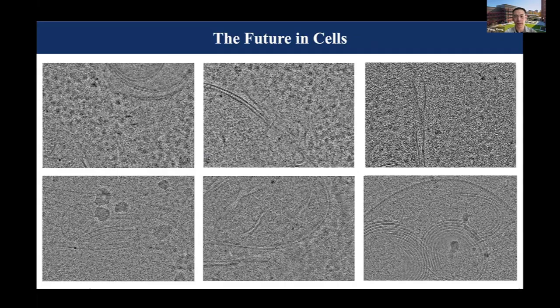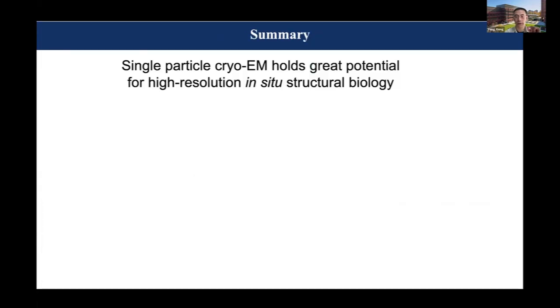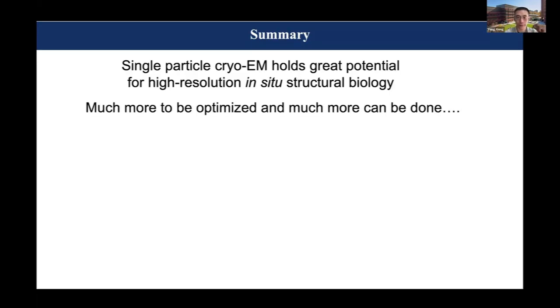We become cell biologists. We're trying to figure out different types of complexes in the cell and get them to a high resolution. So the take home message is that this is a method that bridges the traditional single particle type of work to the cryo-ET type of work you heard from Grant, and it has great potential for in situ structural biology.